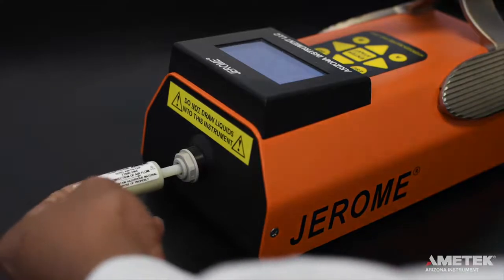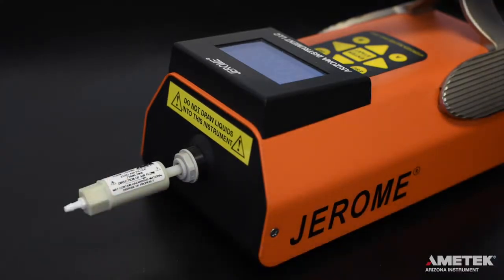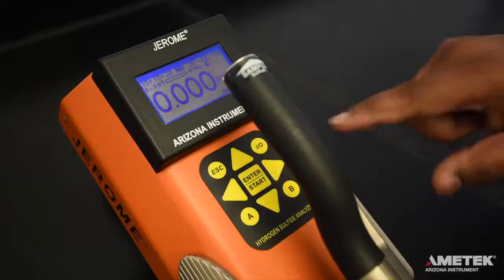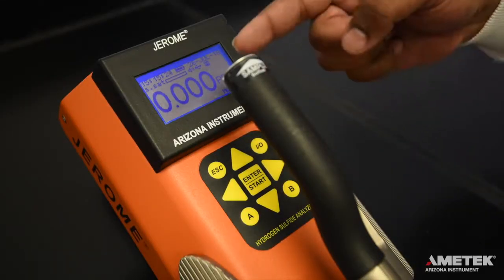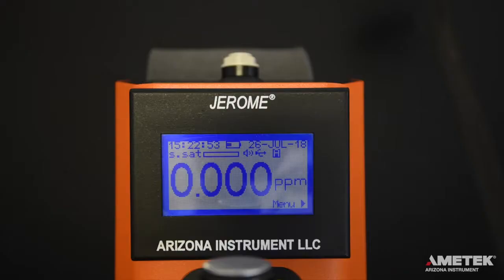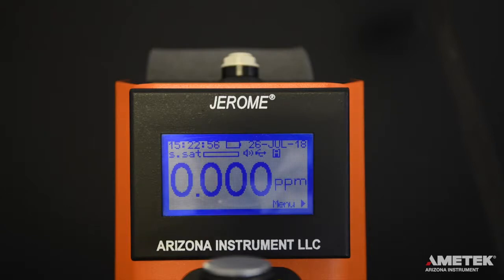To perform the clean air system check, insert the zero air filter into the intake port located on the front of your J605 so that the arrow on the label is pointing toward the instrument. Once inserted, take five samples, waiting 15 seconds between each to maximize sample accuracy and allow the sensor to restabilize. To take a sample, press the enter button on the main screen or the silver sample button located at the tip of the handle. Readings should decrease and at least three of the five readings should be at 0.000 ppm. If readings are not 0.000 ppm, contact Ametek Arizona Instrument or your local representative for assistance.